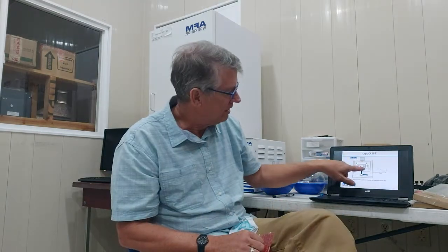And so if we put the scanner inside there and we drive that needle down, we see the cantilever bends. That's not a surprise, right? See there, it bends right there, and that causes the light to go across the cantilever. So now I can look at the voltage output, and I can see that when I hit the surface, the top minus bottom signal changes, and the electronic signal changes.